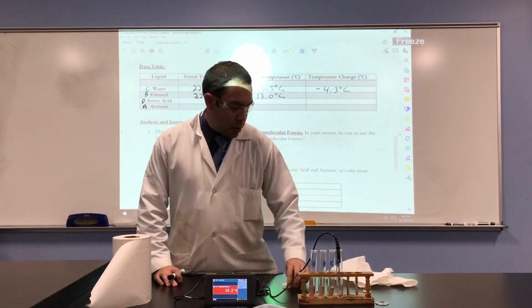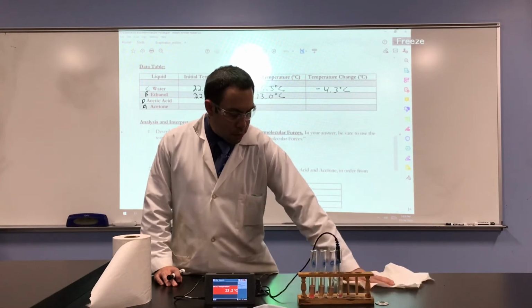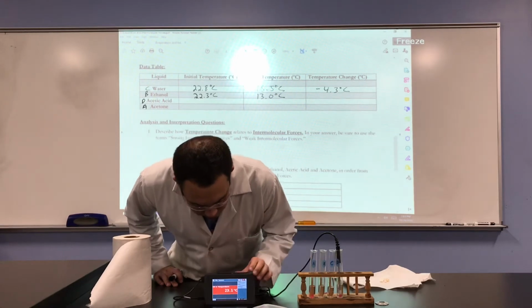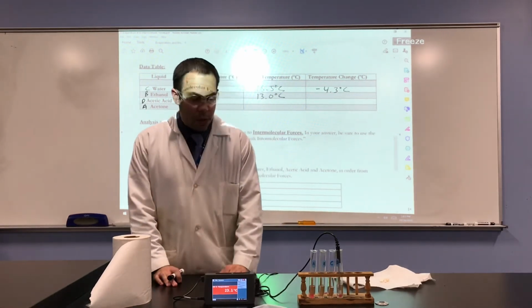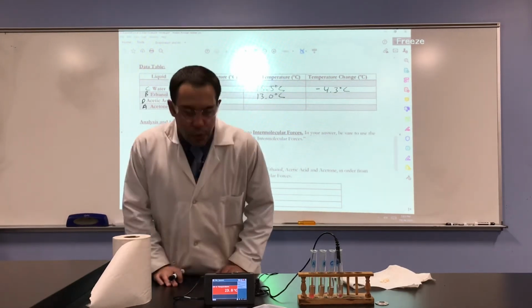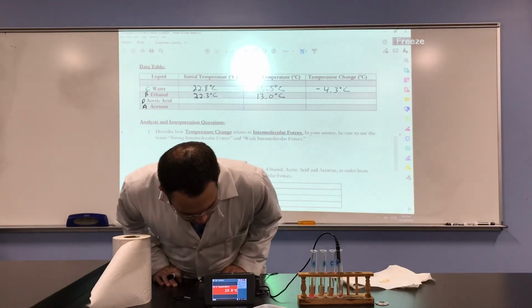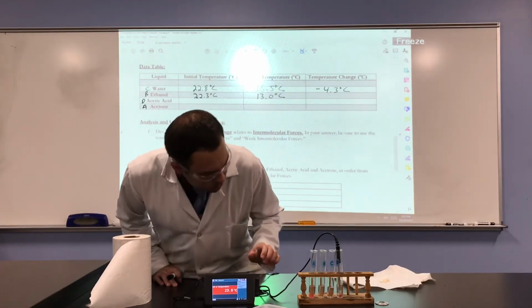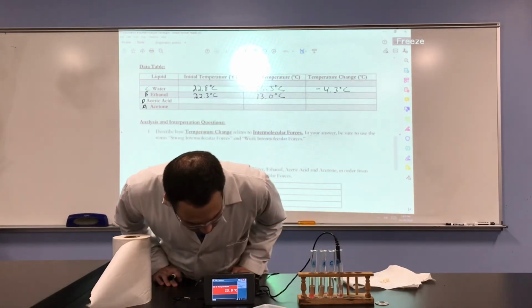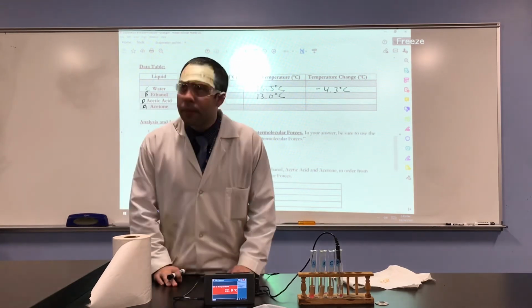23.3. You can always clean up the area while you wait. 23.1, we'll give it a couple seconds, see if it changes. 23.1. 23.0. 22.9.